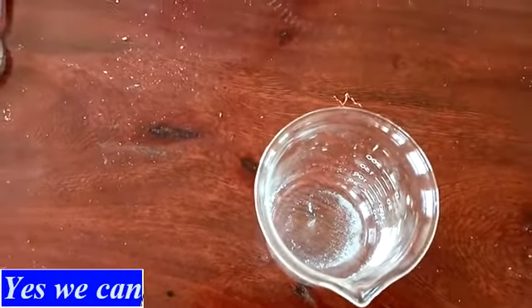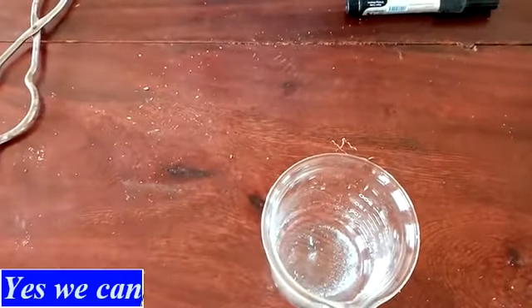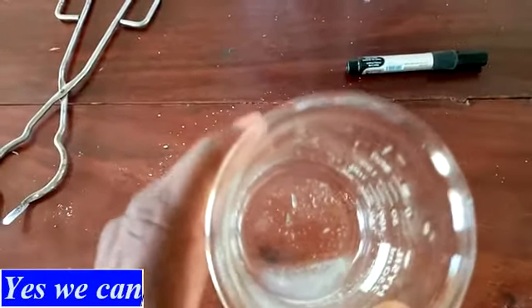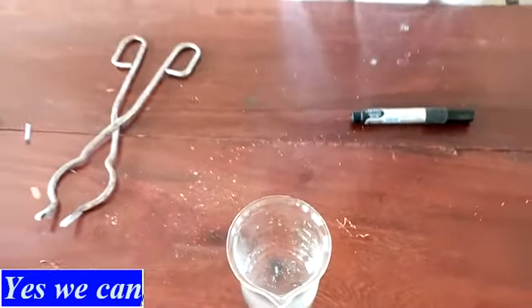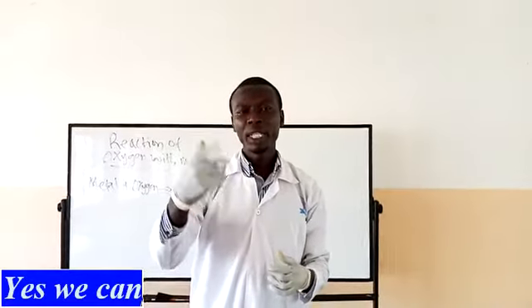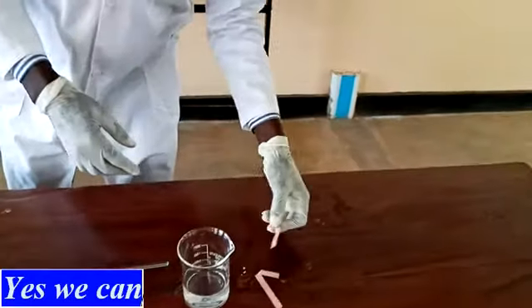It slightly just dissolves. Now, we want to test the resultant solution with red litmus paper. If it is really alkaline in nature, then it must be able to turn the color of red litmus paper to blue. So we have here red litmus paper.